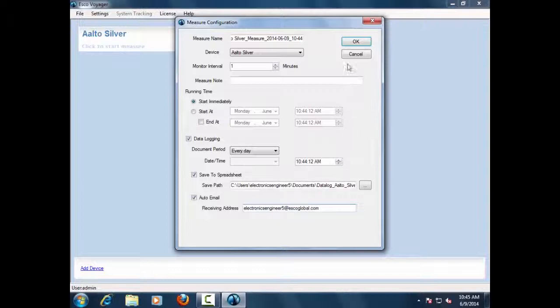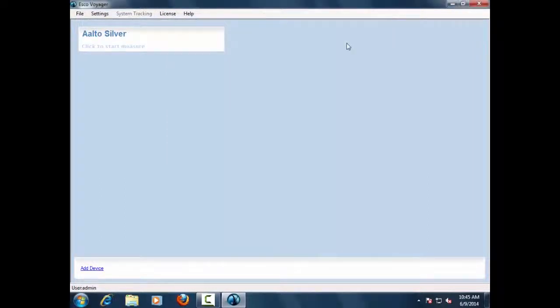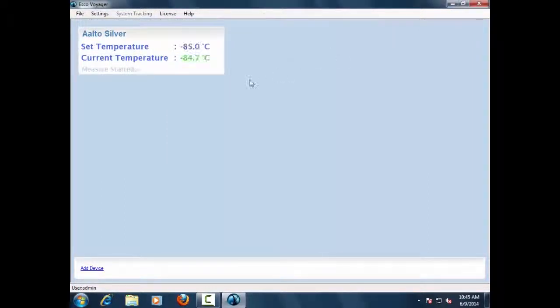Upon confirming the measurement settings, the connected unit will now display the actual setpoint and current monitor.